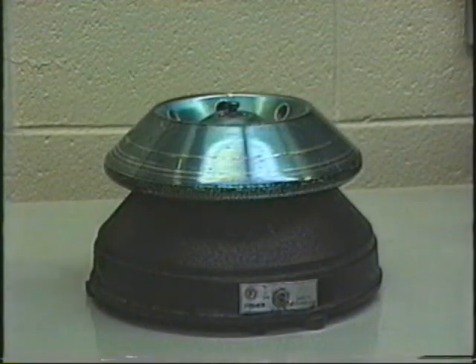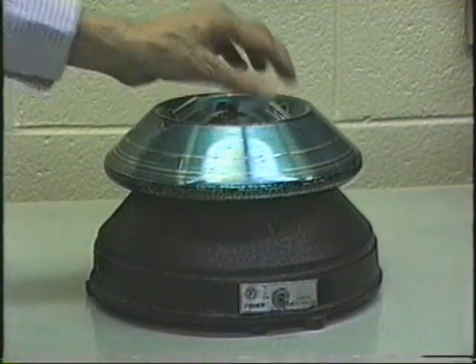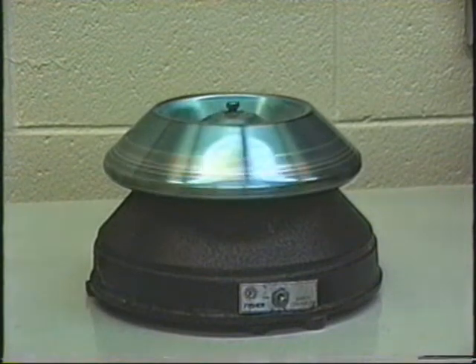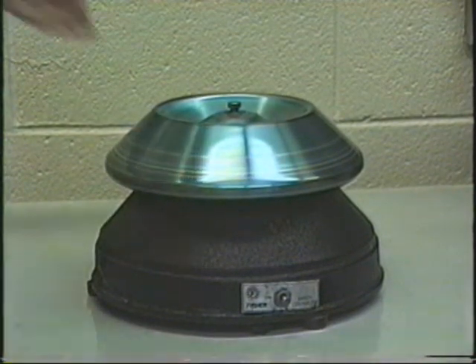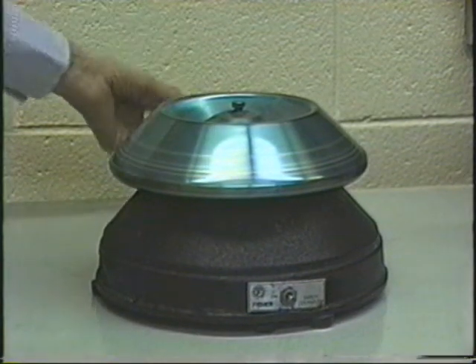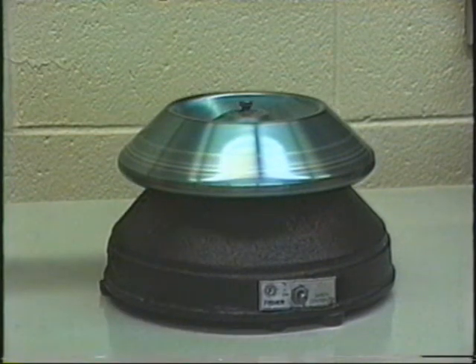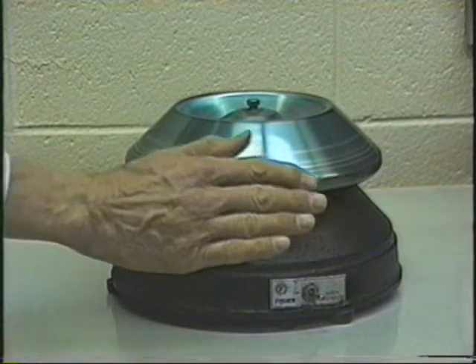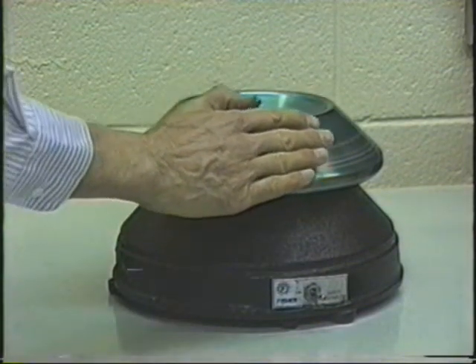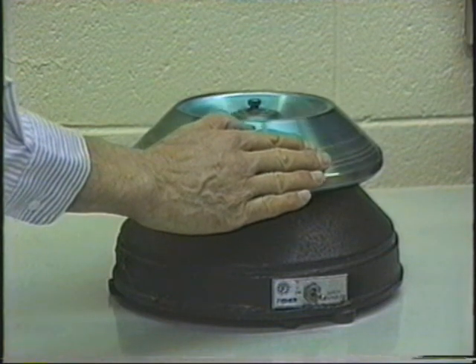All right, let's go over that one more time then. Make sure that when you put something in to centrifuge, you put a counterbalancing tube in. Then when you turn it on, make sure you keep watching it so that the centrifuge doesn't tend to wobble. Make sure it doesn't touch anything such as the cord. Keep your hands away from the centrifuge while spinning, particularly on the top here. And then when you turn it off and you want to slow down, make sure your fingers are in the direction of the spin, and then just lightly, gently slow it down.